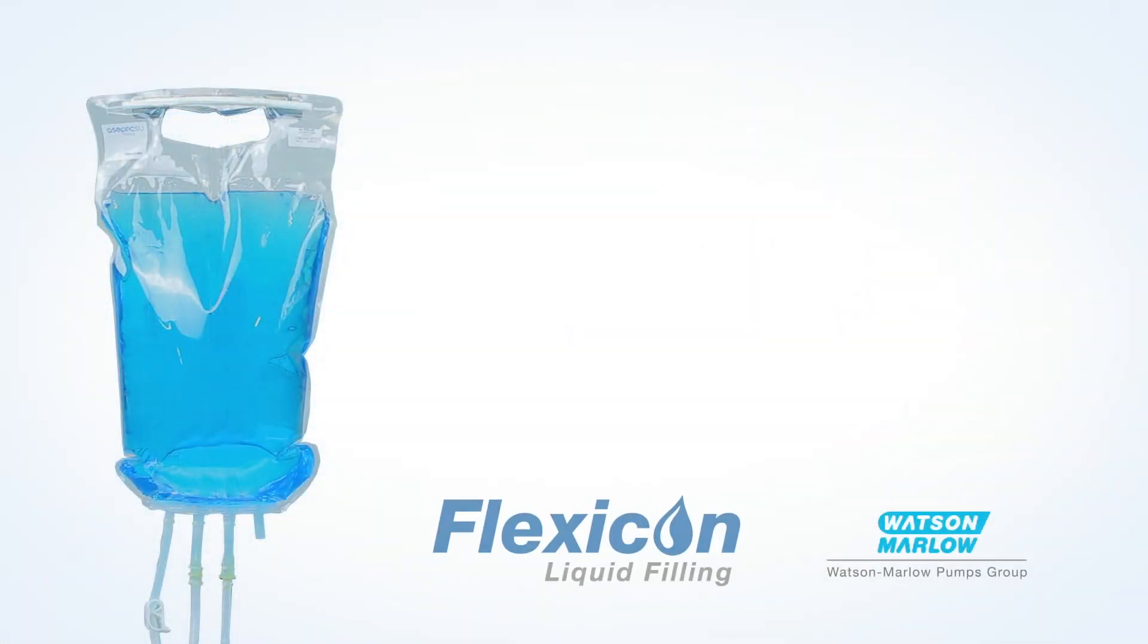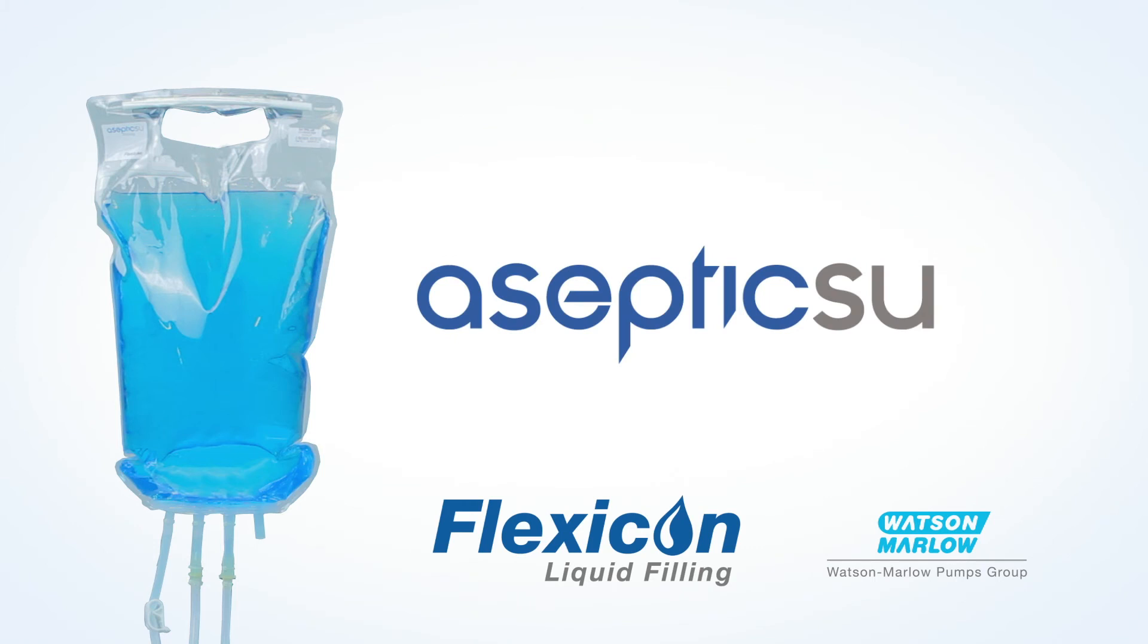The Aseptic closed fluid transfer technology helps protect product properties, reduce costs, ensures effective dispensing and simplifies traceability.